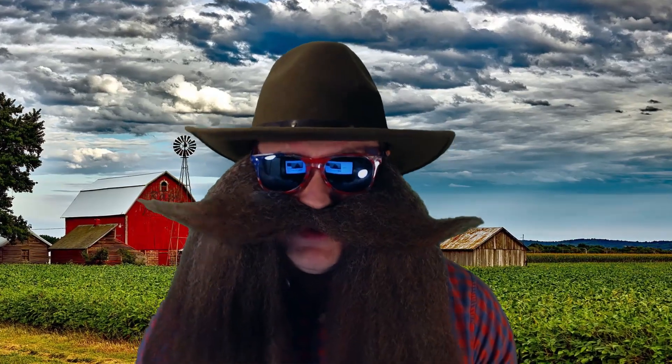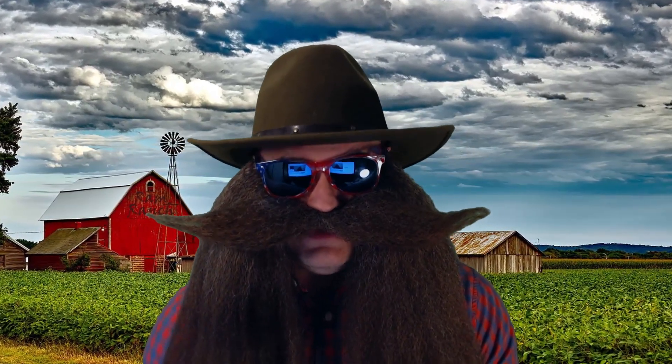Well howdy ya flea bitten varmints! Join me in this video where we take an itsy bitsy teeny weeny little short lab Liebig and turn it into a monster dread 36 inches that will get the job done. Yee-haw!